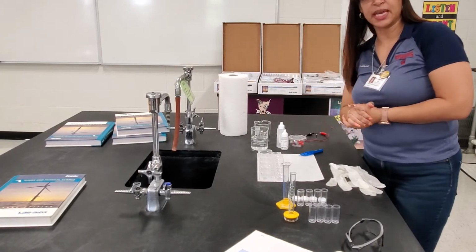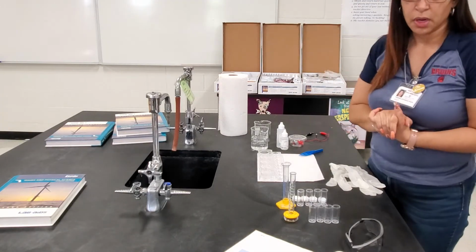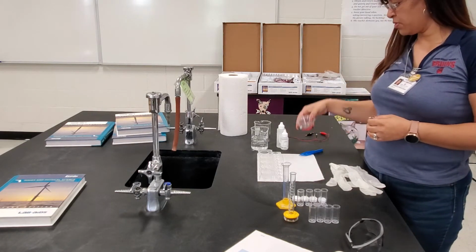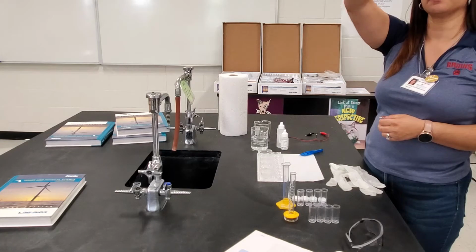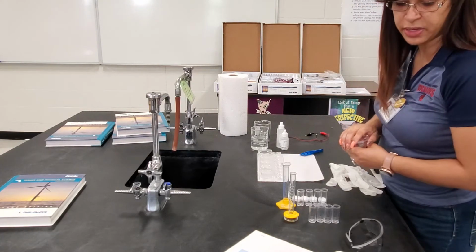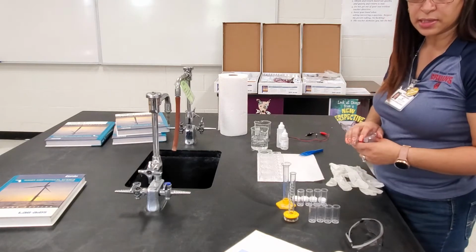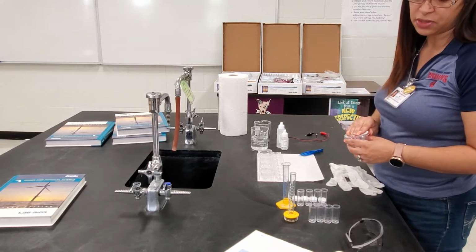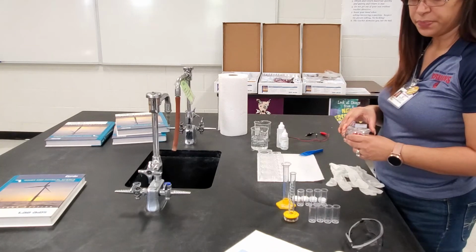Today we're going to be looking at activity 7. We're going to be working on identifying solids. So we have all the solids that were in our unknown substance, and we're going to be conducting some tests to identify electrical conductivity, density relative to water, density relative to ethanol, and reactions with copper chloride.